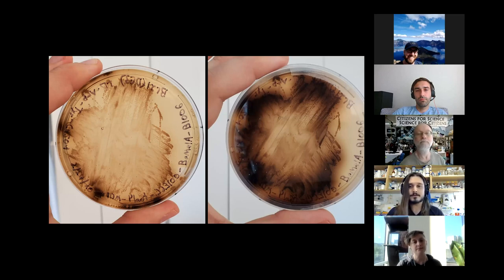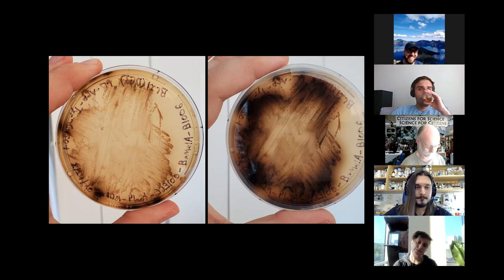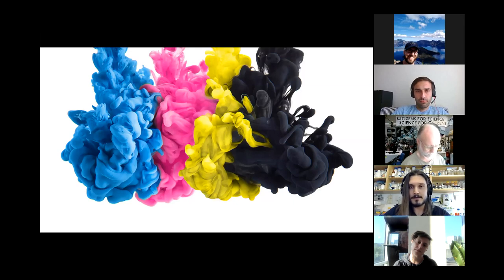So left and right are about, I think, 5 days apart, just left at room temperature. It slowly got darker, to the point where it started producing more and more melanin. I have some other plates, I don't know why I didn't include them in this talk, showing the right side as a control and the left side positive with tyrosinase, MEL-A, from Rhizobium etli. So slowly but surely, I was cobbling together the basic colors of CMYK, right?